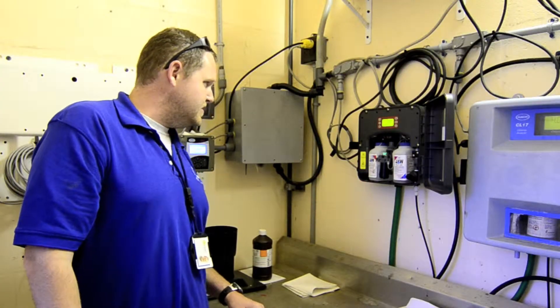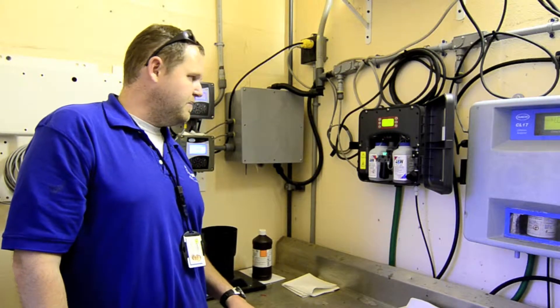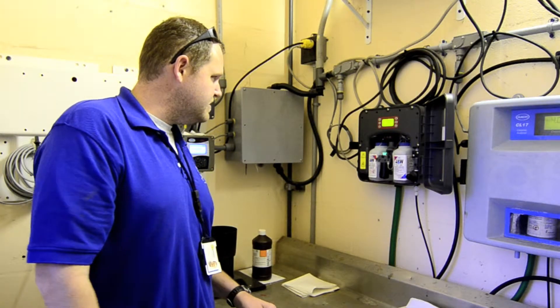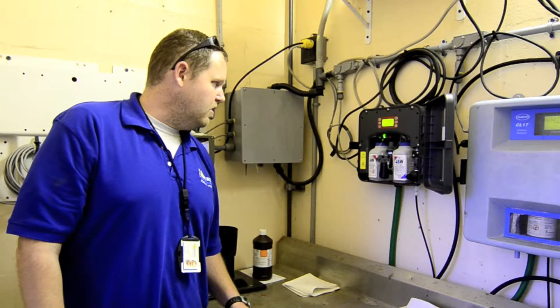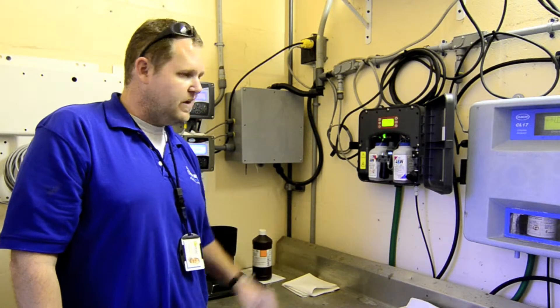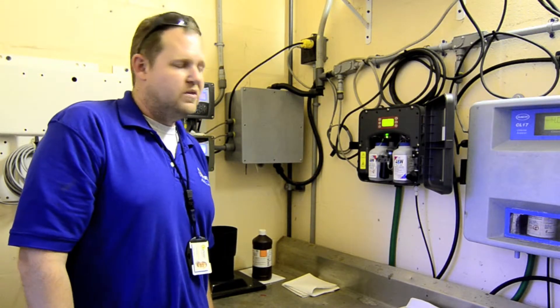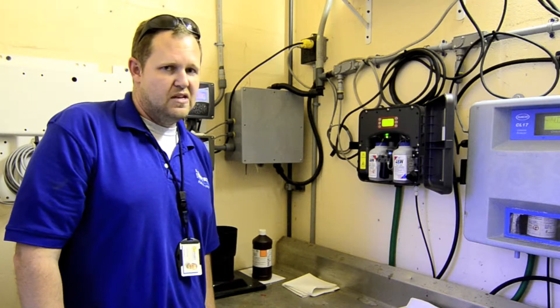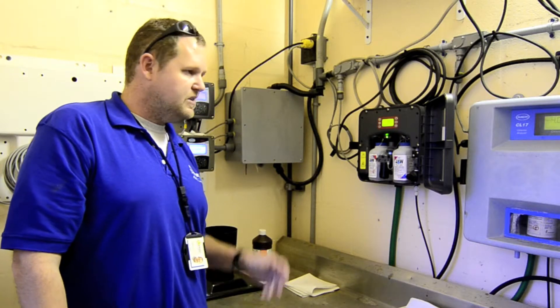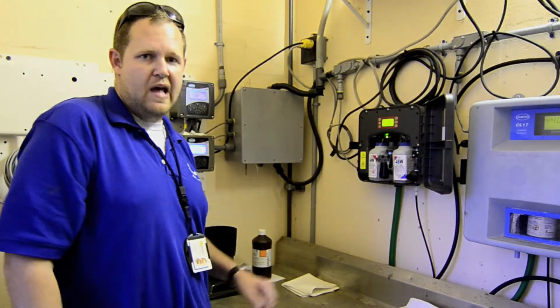One of the nicer things about this is that there's about 150 feet of half-inch sample line between here and the actual blend tank itself, and the water can lose a little bit of residual along the way. It's nice to be able to adjust the reading in the unit — something we haven't necessarily been able to do with the CL17s as effectively. It's nice to be able to get this thing to read exactly what's coming out of the blend tank rather than at the end of a 150-foot line.